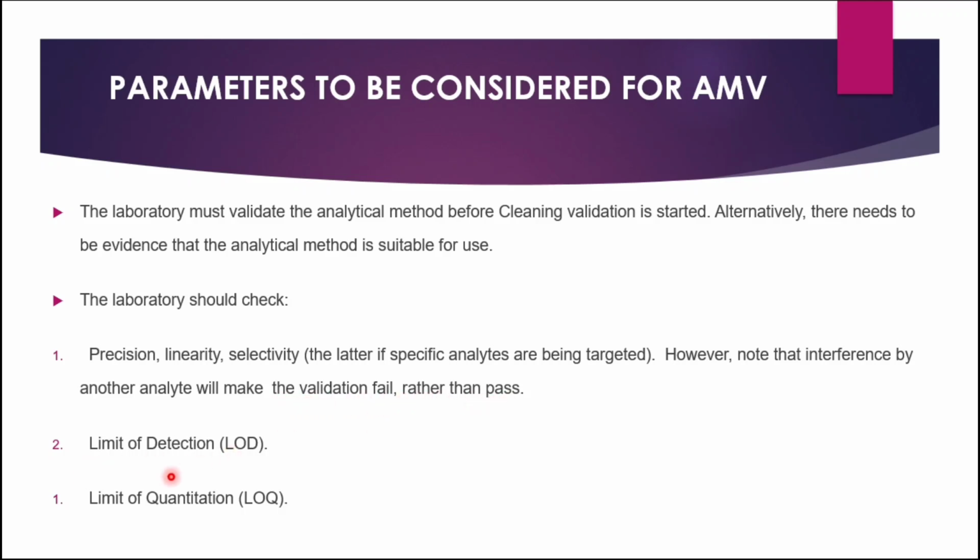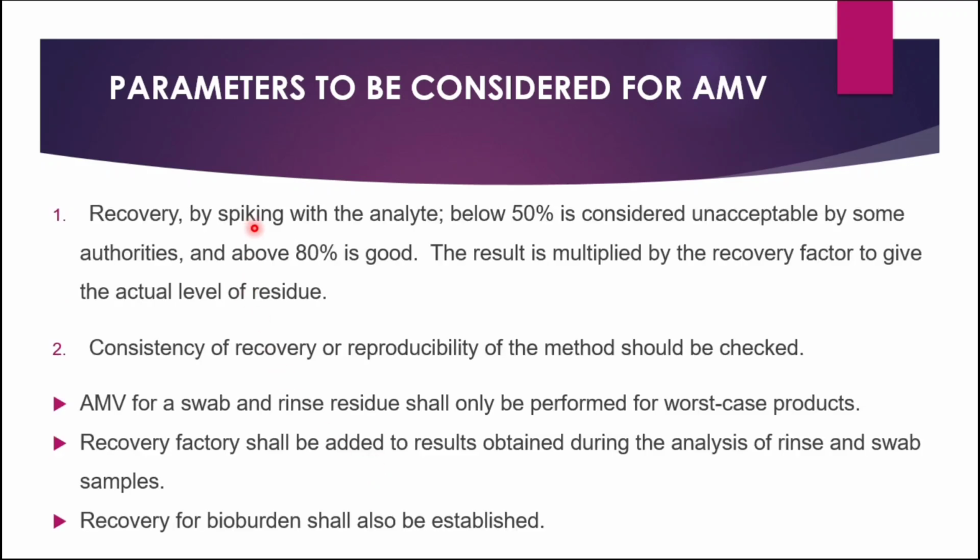Limit of detection, limit of quantification you need to consider. Recovery by spiking with the analyte below 50% is considered unacceptable by some authorities. So it is better to consider 80% is good. So it is better to consider recovery above 80%. The result is multiplied by the recovery factor to give the actual level of residue. Consistency of recovery or reproducibility of the method should be checked.